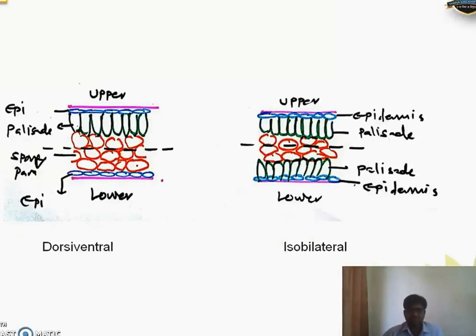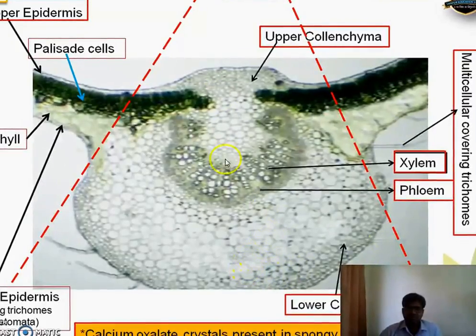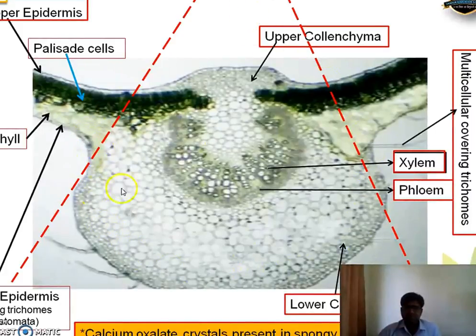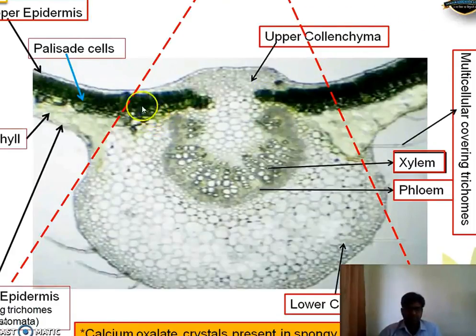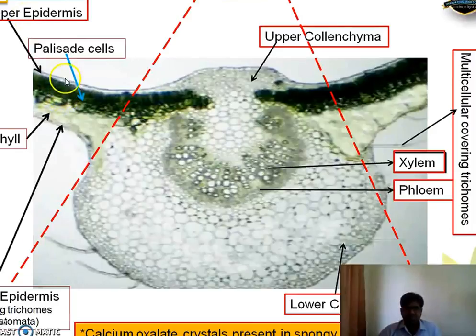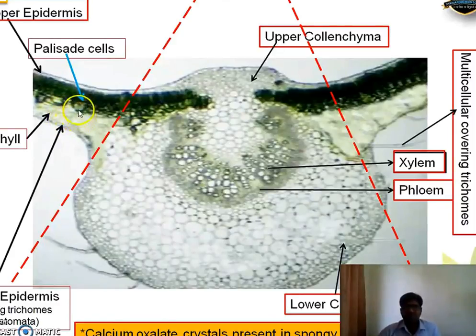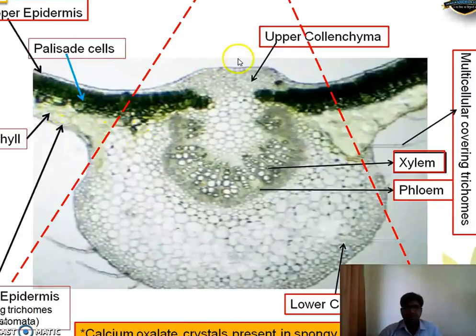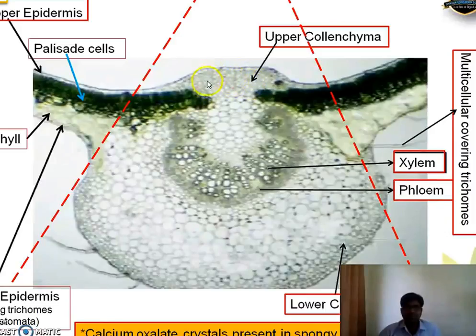Now we will actually see the TS of Vasaka. This section is passing through the midrib, shown by a red dotted line, and the region to the side is the lamina. In the lamina region, there is a cuticle, followed by green palisade cells, and then loosely arranged spongy parenchyma cells which appear clear and don't show the presence of chlorophyll, followed by lower epidermis which is cutinized. In the midrib region, the same cuticleized epidermis extends, followed by collenchyma with small lumen, thick walls, and closely arranged non-lignified cells providing mechanical strength.